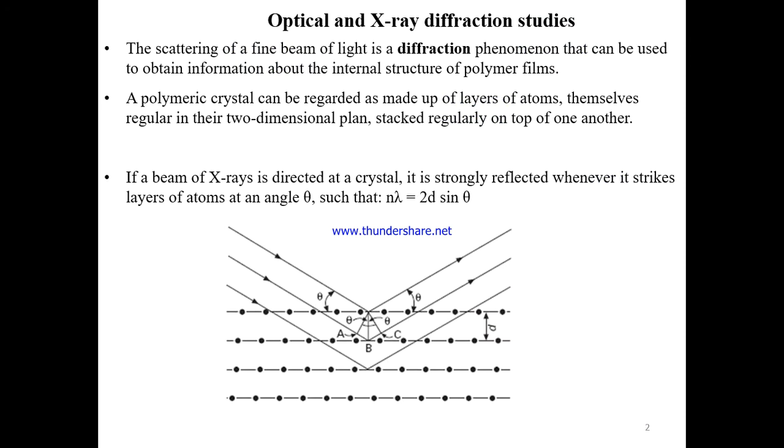So diffraction, as you know, is one of the important phenomena of light. You know there are a few phenomena of light which are very important: reflection, refraction, diffraction, polarization, etc. Diffraction is one of the phenomena of light which has been successfully used for structural investigation of fiber. Now in this topic we shall understand how the diffraction phenomena of light as well as X-ray is successfully used to investigate the physical structure of the fiber.